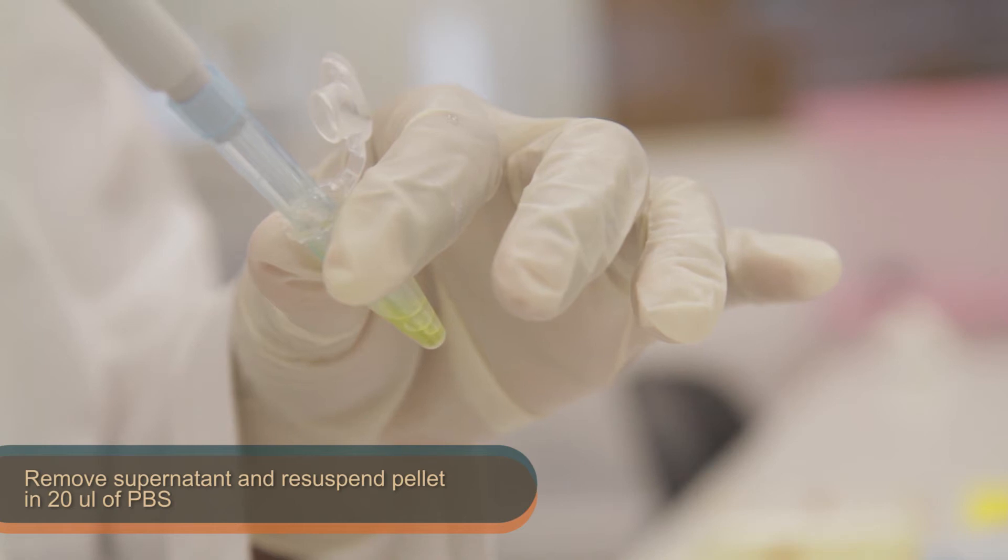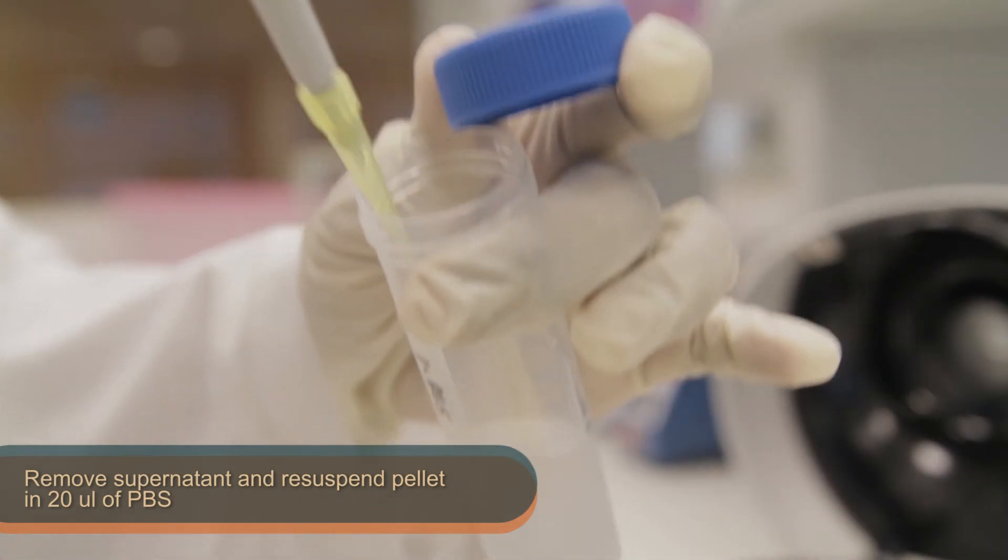Then, remove the supernatant carefully and re-suspend the cell pellet in 20 µl of PBS.